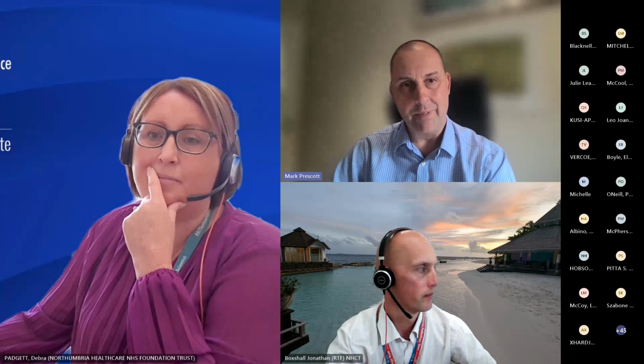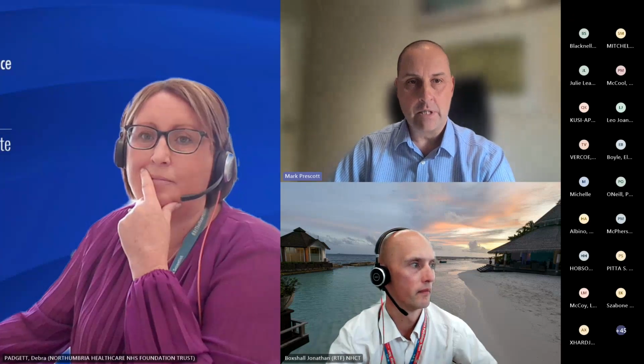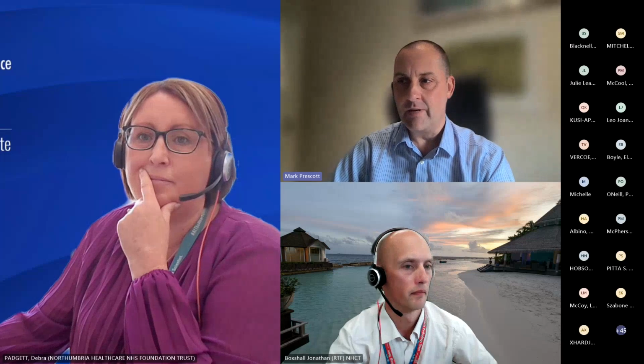Mark, do you have anything to add to that one? Are you happy? Yeah, I agree with Jonathan. I think it's really down to labs to identify what you need to start using it. What are the key aspects of this LIMS, so that you've done the training and competency in those areas, but you're aware that you're making changes all along. As long as you keep a record of those changes and show that you are phasing in the training and competency of those areas, I would imagine that will be sufficient.